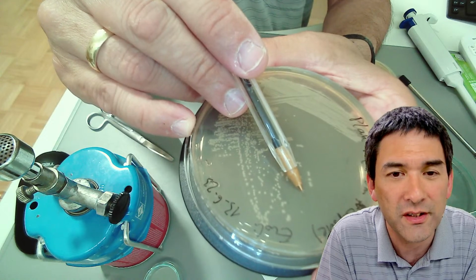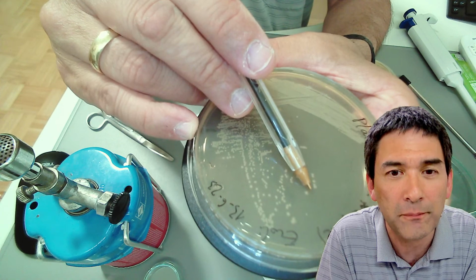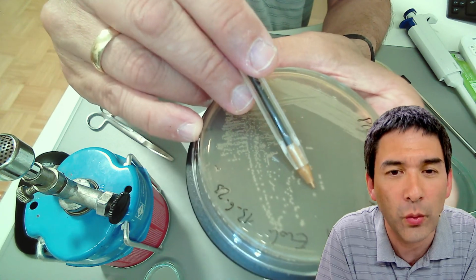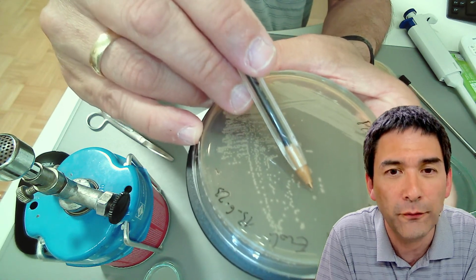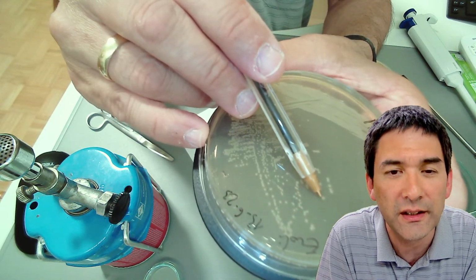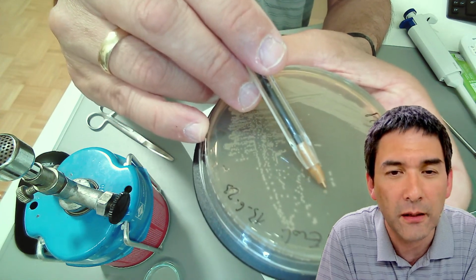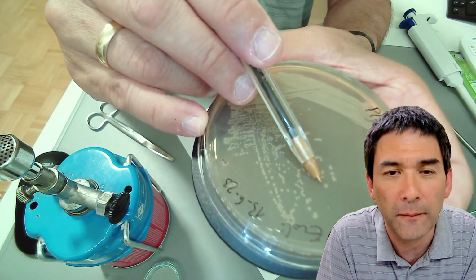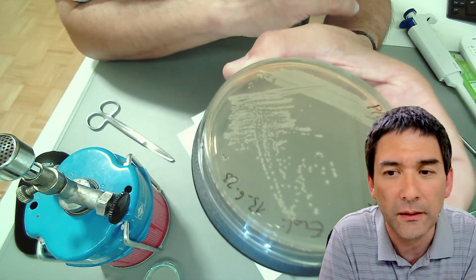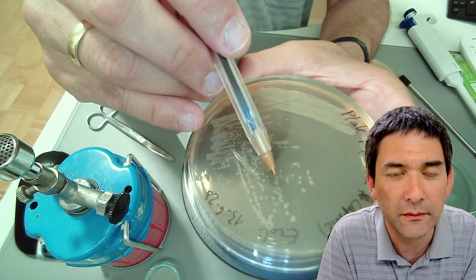This one has much more food available because it's further away from the others, so the food is able to diffuse to it, and it produces wastes that are also able to diffuse away more easily. So this is the idea.